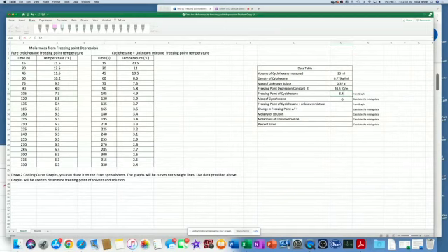Degrees Celsius. You're going to write degrees Celsius here, so I'm just going to put 6.4 C. And then from the mixture, I got 4.5, also degrees Celsius. Let me see what the difference is. Now I made up these numbers, 6.4 minus 4.5.